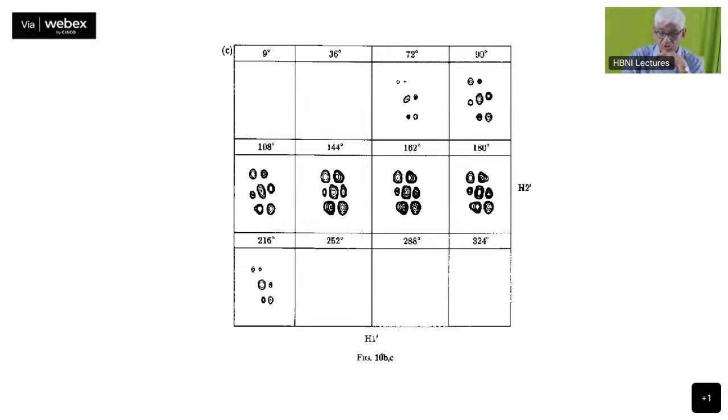Okay, and this will also be very useful to identify what sort of a sugar geometry you have in your molecule. If we don't see these peaks at all, then it means it is in the C3' geometry. But you see strong peaks here in this 162, 180 region. It indicates you have sugar geometry in the area of 162, 180 and so on. And that is in the C2' geometry, typically for the B-DNA.